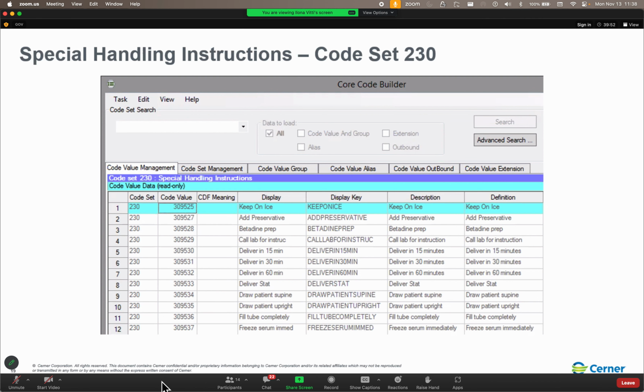Now again, thankfully, most of our modern analyzers are not limited to 12 characters, but it is something to be aware of here, especially if your site is setting up site prefixes. You may need to go out and increase the max accession size for your collection classes in order to accommodate those extra digits.